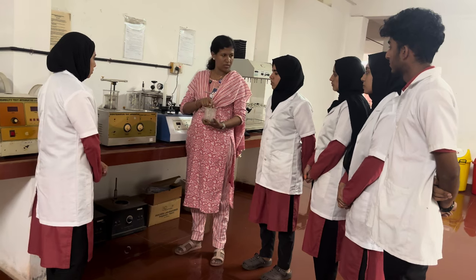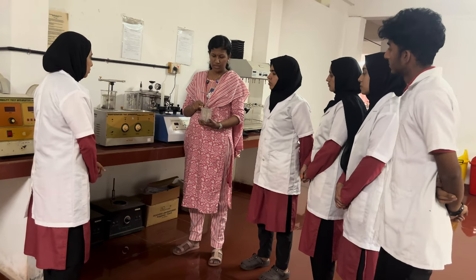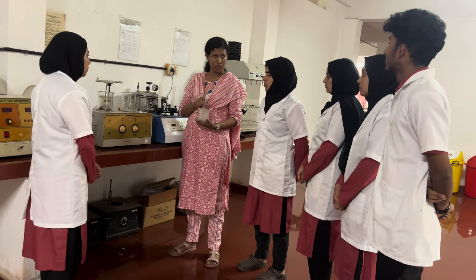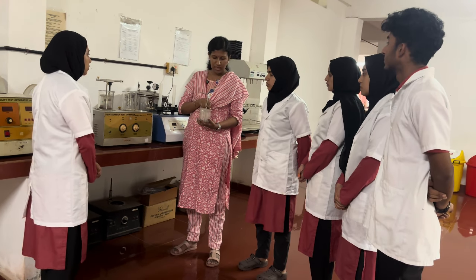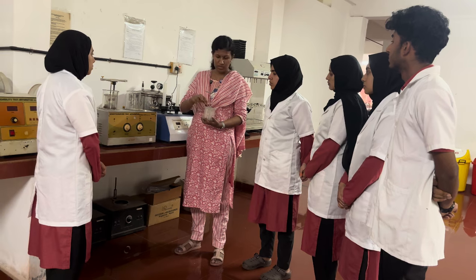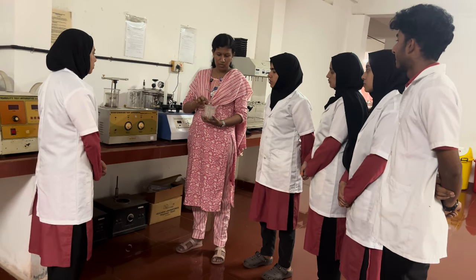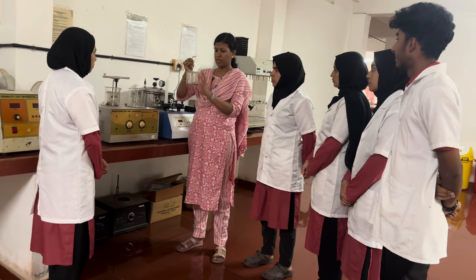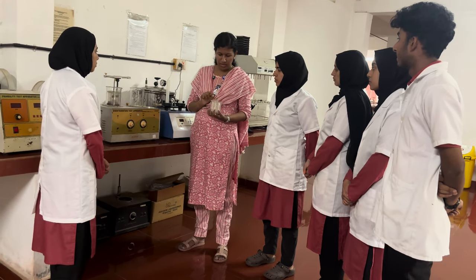There are six holes in the transparent plastic. Okay, and these six holes are at an equal distance from the center rod, and they are equally spaced from each other. The distance between these two is the same as between these two. So that is how it is made in these transparent plates, and you can see the glass tubes.